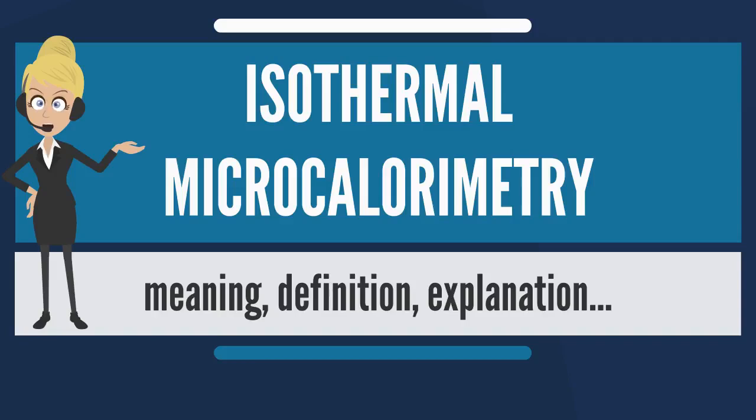IMC is a powerful and versatile analytical tool for four closely related reasons. 1. All chemical and physical processes are either exothermic or endothermic, they produce or consume heat. 2. The rate of heat flow is proportional to the rate of the process taking place.